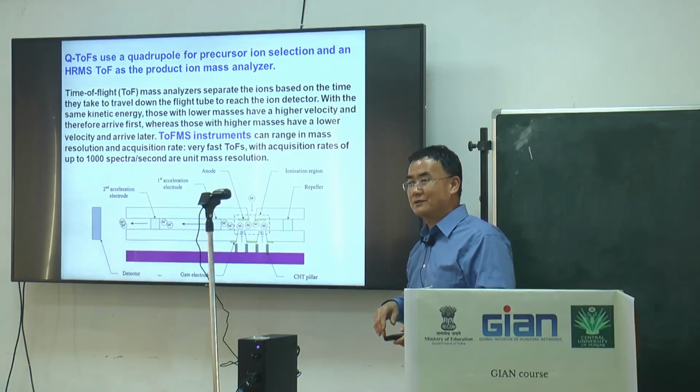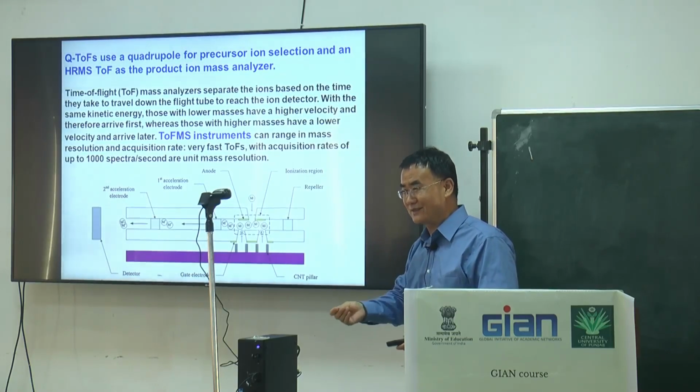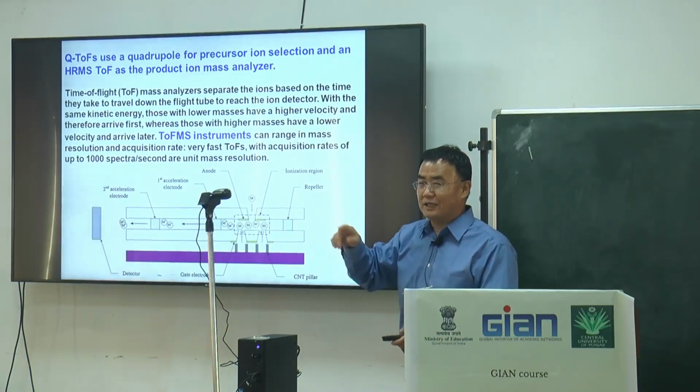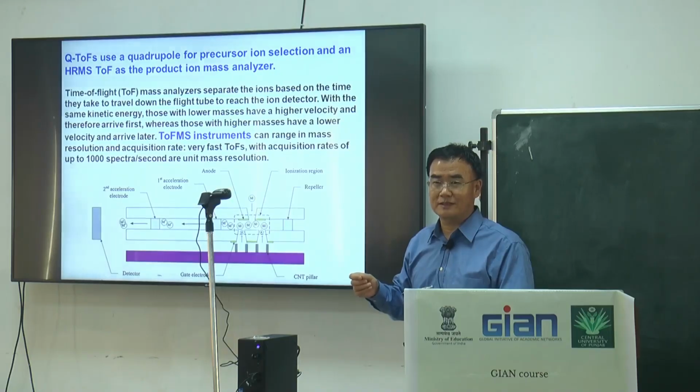What company usually makes the membrane filter? Millipore, right? Yes, Millipore. After filtration, we prepare the sample and do the injection. Normally with HPLC we inject 5 microliters or 10 microliters.